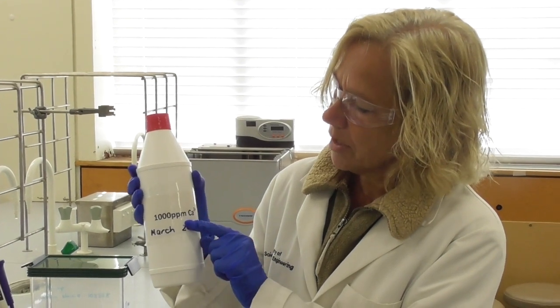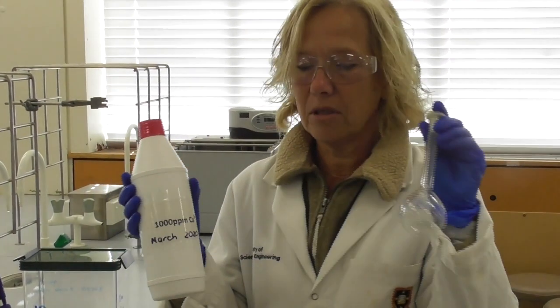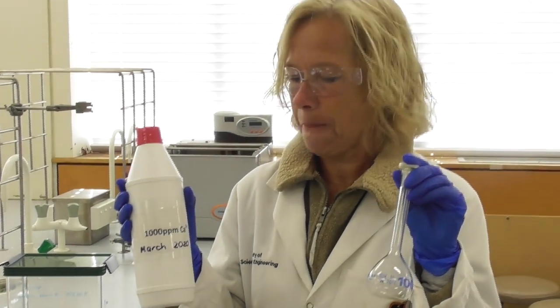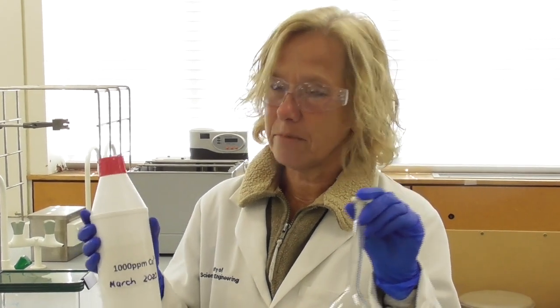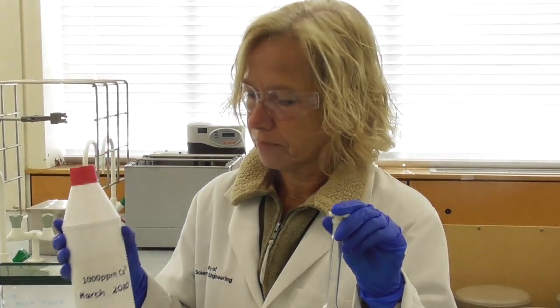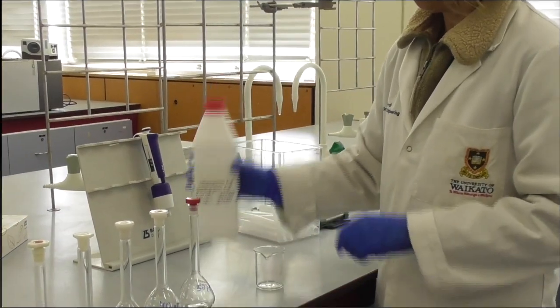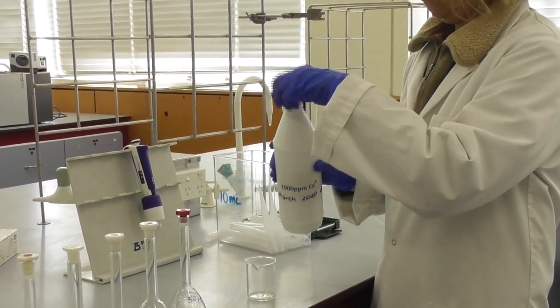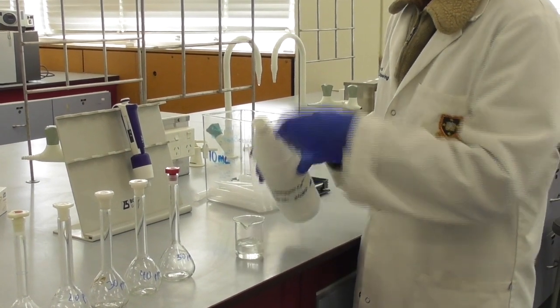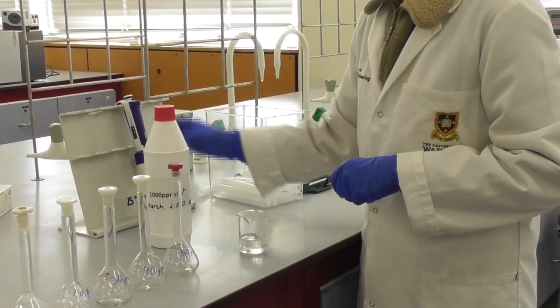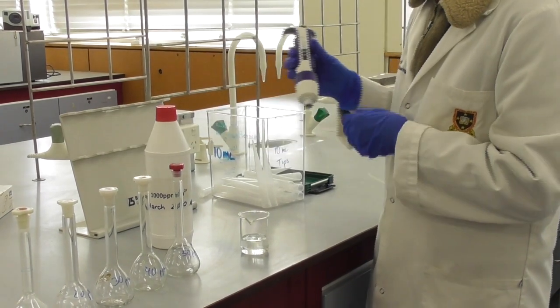So I start out with a 1000 ppm calcium stock solution and I need to prepare my standards in 100 milliliter volumetric flasks. So how much of my stock solution do I need to add to the flask? I pour some of the stock solution into a clean beaker just for the ease of handling.